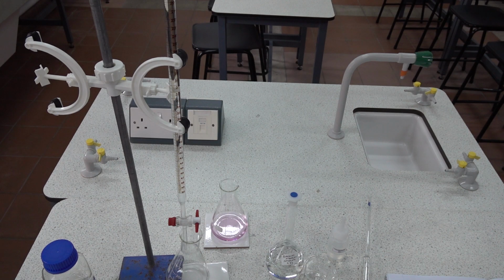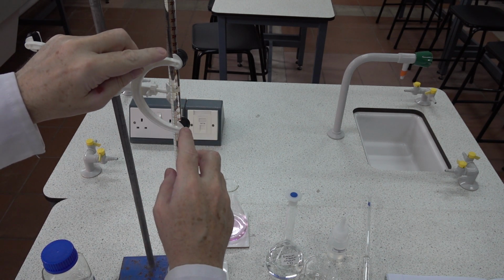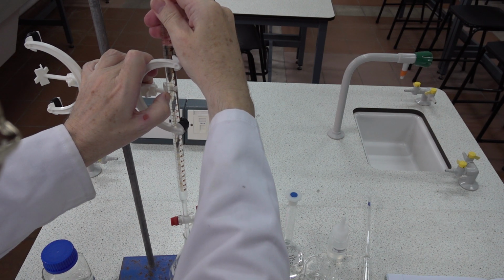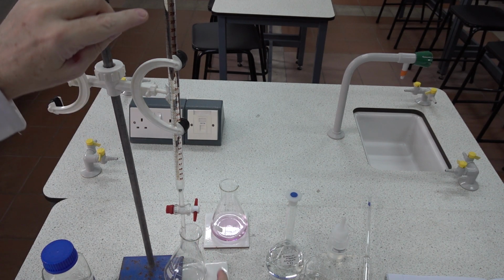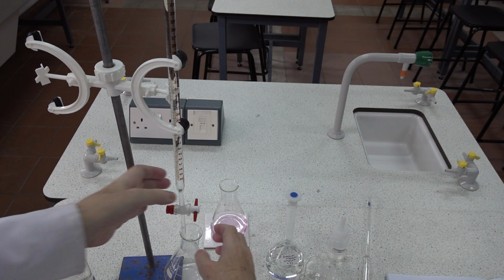Now, we've already done the rangefinder titration and we found that we needed 27.5 centimeters cubed of the sodium hydroxide to neutralize the acid. So 27.5 plus 0.7 is 28.2. So we should be able to run down to 27.2, which, luckily we've looked at that, will be obscured by the burette there. So let's just raise the burette slightly. So still in the flask there. So we can run down to 27.2 and we should be within a mil of the end point of the titration. So let's give that a go.